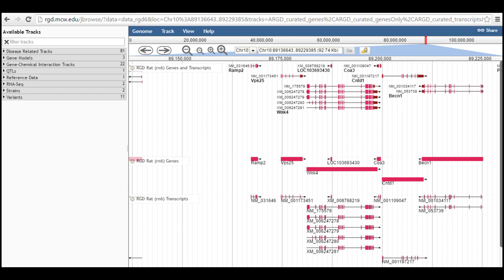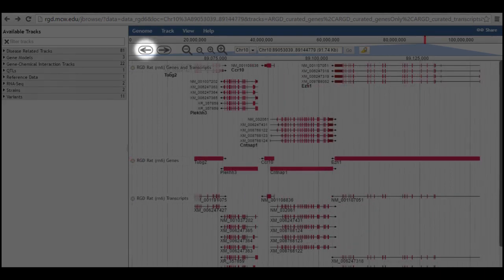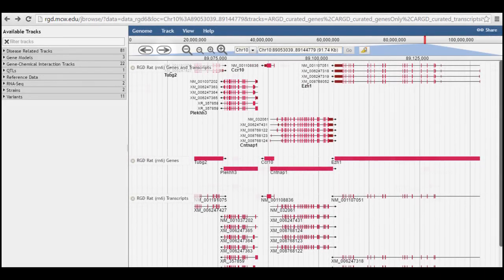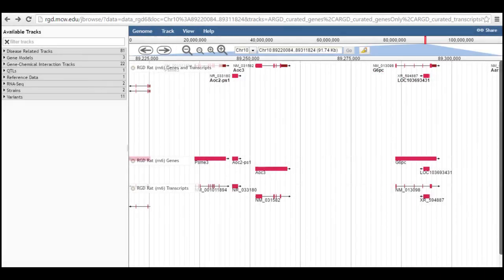The navigation tools between the number bars include arrow buttons, which move the display either left or right one screen width.